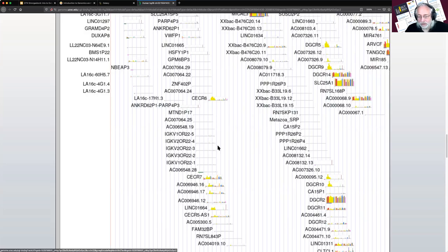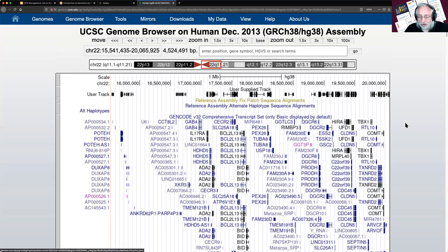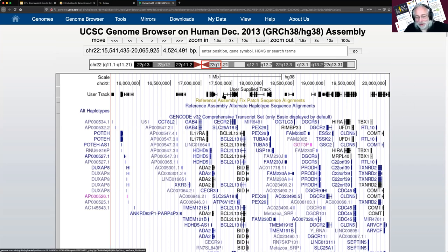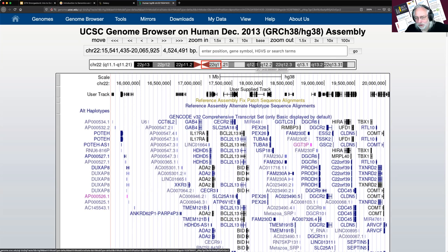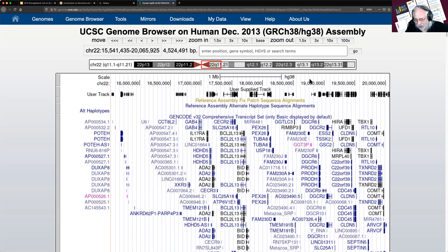Down below is all sorts of information UCSC has about this region — allelic variant phenotypes, gene expression from GTEx, and more. If you want even more information, you can turn on all sorts of additional tracks. It's a phenomenal resource. Right now though, this huge amount of data is on the overwhelming side. To find something overlapping, we can zoom in using the controls or by clicking and dragging on the chromosome display.